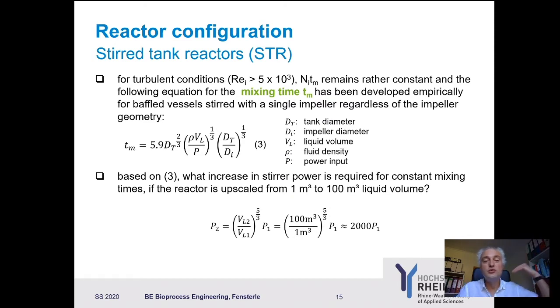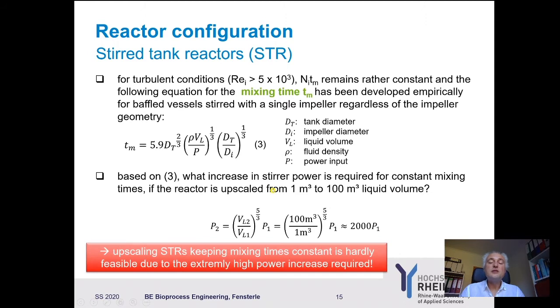So, really huge bioreactors. Also, if you upscale, usually the mixing time will increase, because you usually can't keep the mixing time constant over all the upscaling, because this exponential increase of the power you don't manage.